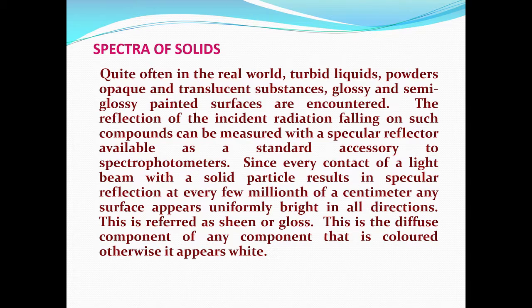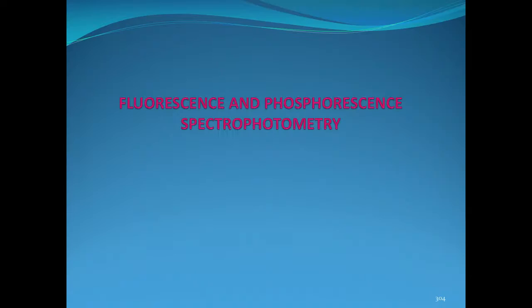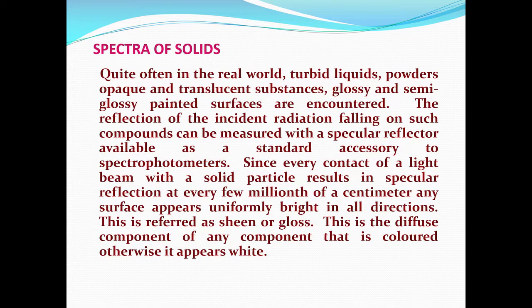This accessory should be able to tell us how the surface of a painted material or plated material is. Electroplating also is done on a number of materials, and the quality of the plating can also be determined by the reflectance spectra. So, what I want to show you is how we go about doing this.